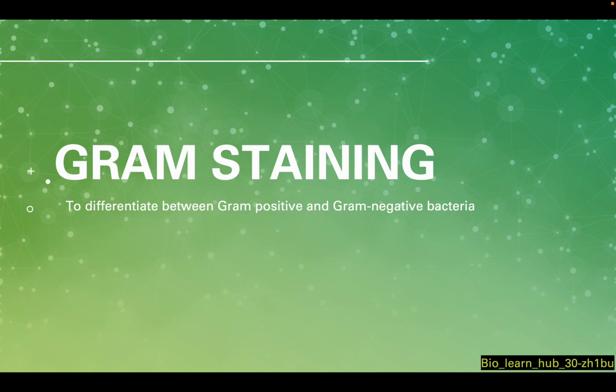With another video, in this video I am going to talk about gram staining, which is the technique to differentiate between gram positive and gram negative bacteria.